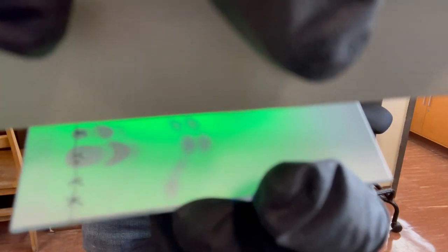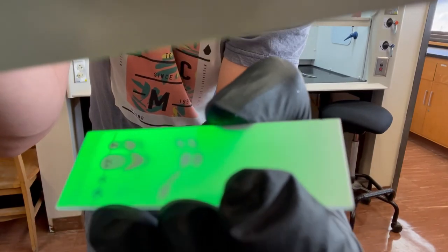I'll take a picture of this and it'll look way better, but I just wanted to show you. So we've got a lot of spots. On this side right here on the bottom, that is the products. The first two are the products. The one on the bottom is the poopy one. The one above it is the perceivably good one. They roughly have a similar RF value.